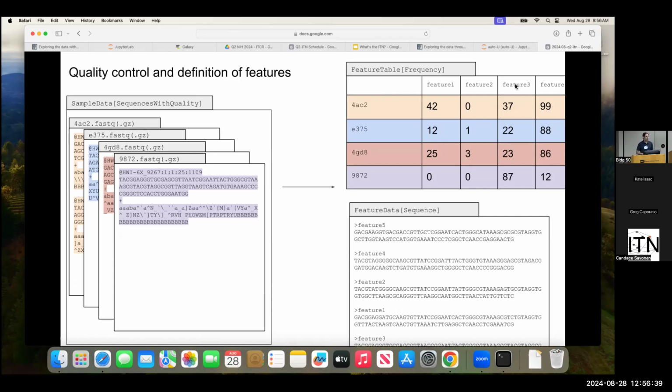One of the other sticking points that somebody mentioned was a little bit of confusion still over that term artifact and what that means exactly. What an artifact is, this is a pretty commonly used term in data science. It basically means the result of some process that you ran or that the computer ran. There's this sort of unfortunate additional use of the term.